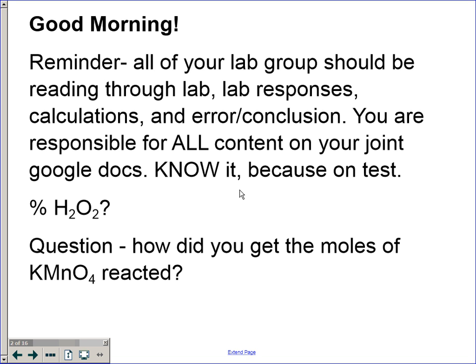In terms of doing colorimetric or spec 20 work, we all should be very familiar with how to do that. Some people are more hands-on with that, some people are more just observing, but you're still responsible for knowing the concepts and the procedures and data analysis, error analysis.